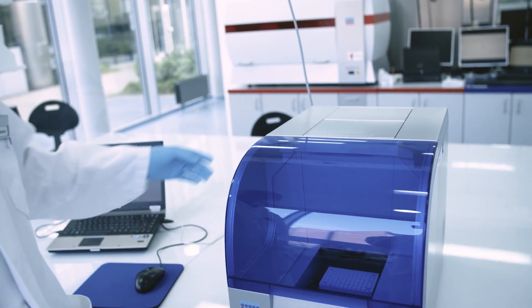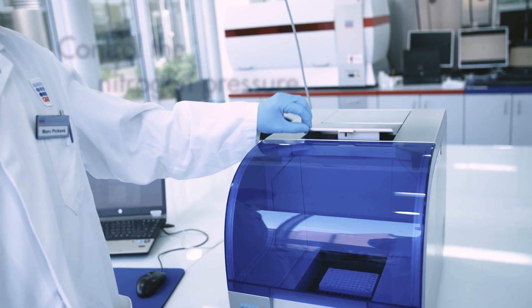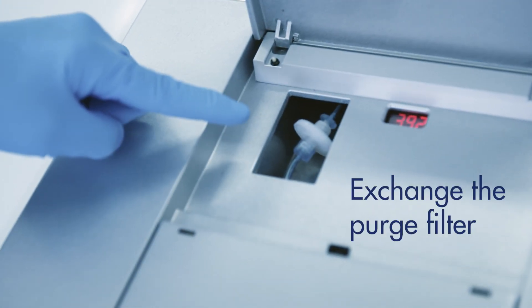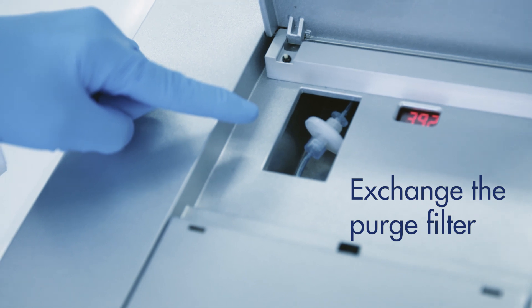At the top of the QIAxcel Advanced, users have access to control the nitrogen pressure and exchange the purge filter if it needs to be replaced.